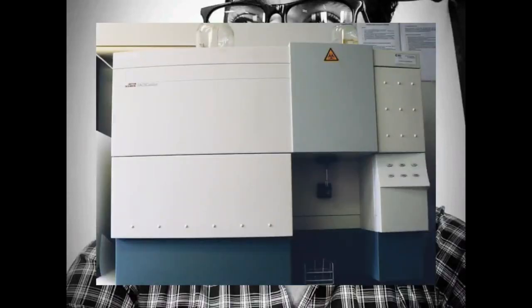Now this is the external view of a flow cytometer. This is how it looks. It looks like a sophisticated apparatus, and it is a sophisticated apparatus. I'm sure you have noticed this portion where a glass tube has been inserted. That is the part where the cell suspension is given from outside the apparatus, and there is a pipette-like thing which sucks it inside, and all the procedure which I showed in the previous part happens inside this apparatus.